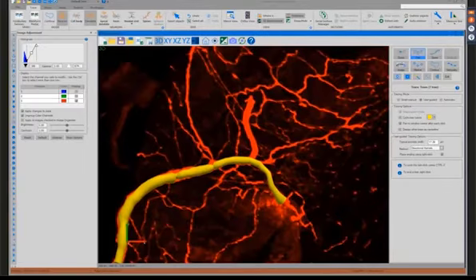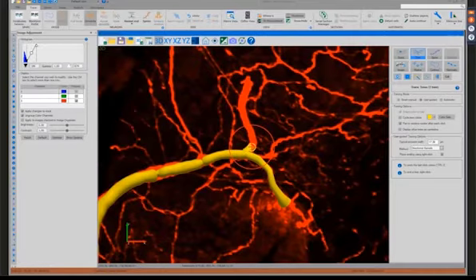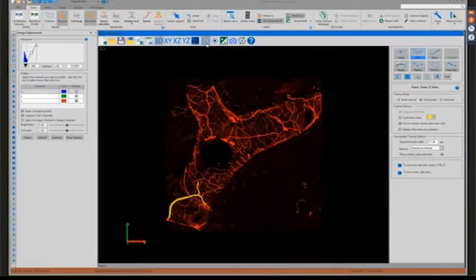And I can also amend any data that you've created by hovering over here. Let's make a bifurcation point here. When I hover over an existing tree, a blue sphere will appear, indicating that that's where we'll make the bifurcation. I'll place a left click and I'll continue to trace this branch. You can also use automatic methods in the same session as both user guided and smart manual.